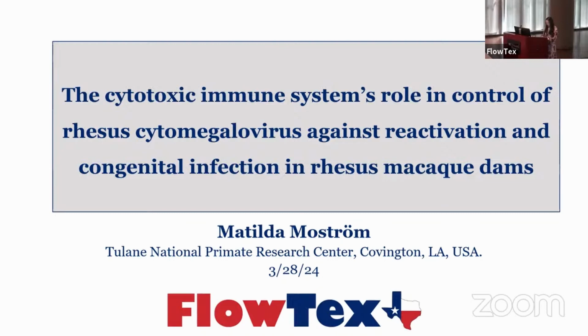And Matilda is currently participating in the NPRC consortium non-human primate flow collaboration project with Becton Dickinson, the BD, to characterize the frequency of over 100 targets in major immune cell subsets of non-human primate species.